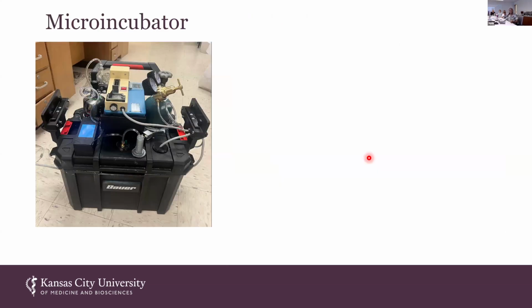So this next slide talks about the microincubator we plan on implementing for the study. My PI, Dr. Wolf, designed this from scratch, in the hopes of being able to regulate conditions such as carbon dioxide, oxygen, temperature and the like. Here we see the nitrogen tank as well as the carbon dioxide tank. We want to be able to regulate those conditions to levels that are also found in the oral cavity.